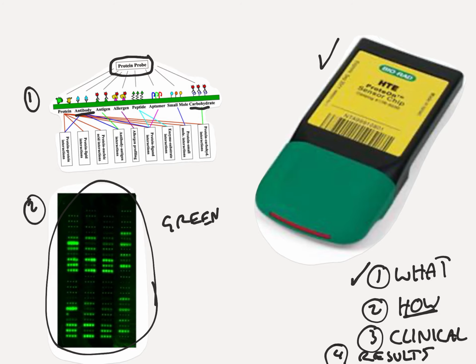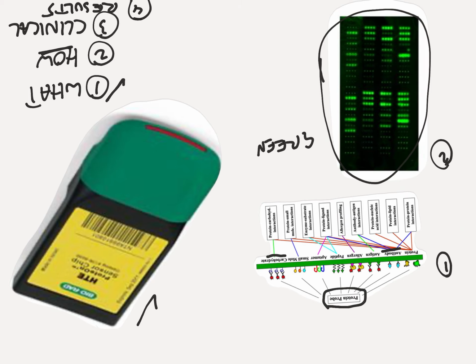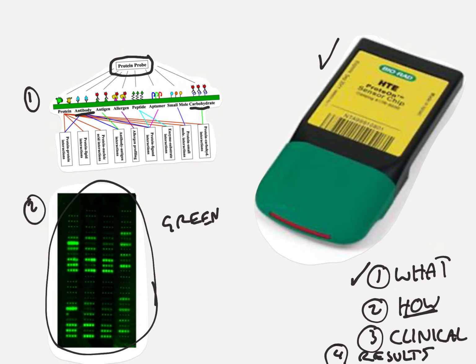There are always 4 things in the equation, with the first one being the protein you want to detect. Okay, suddenly the pen stopped working. Anyway, the first one being the protein you want to detect, and then the second being the capturing agent itself, and the third one being the array itself, the array that everything happens on.